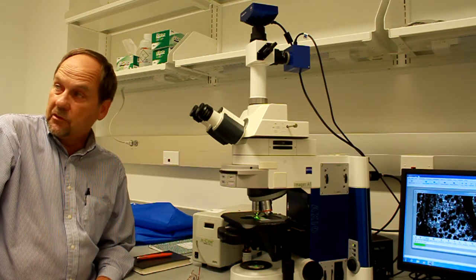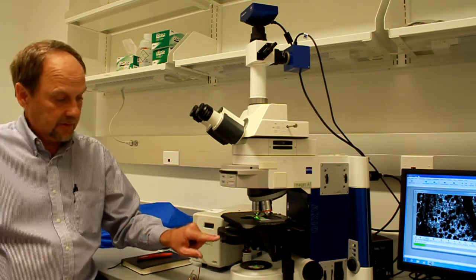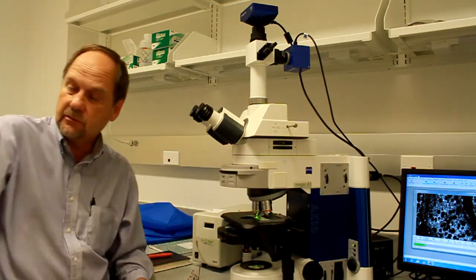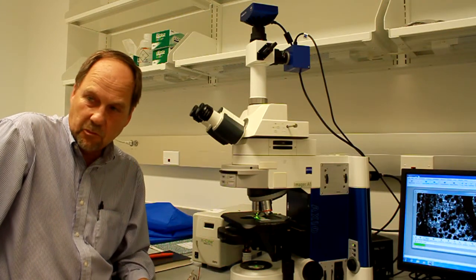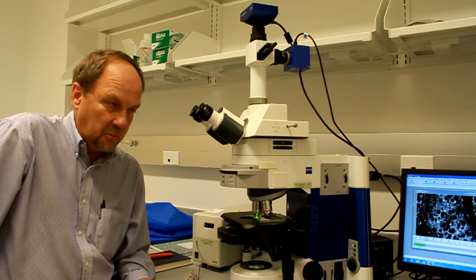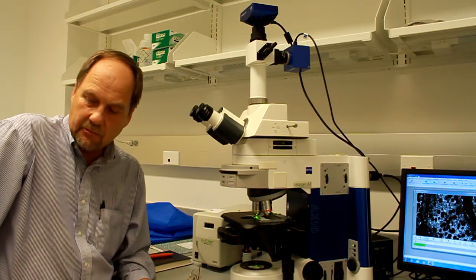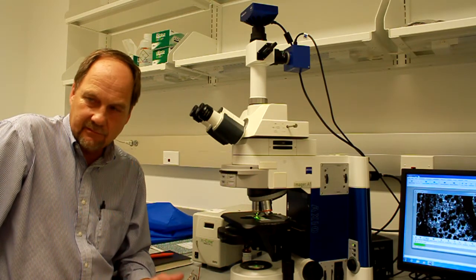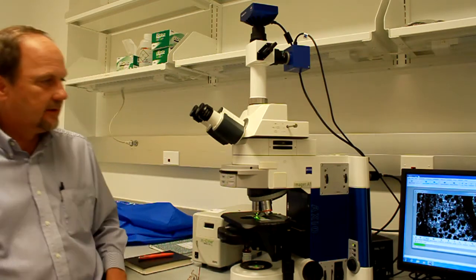There is no rule of thumb on these, as there wasn't on the condenser. No two-thirds open. Normally, the rule of thumb, I would say, is just both of them wide open, because in fluorescence, you try to get all the light that you can.